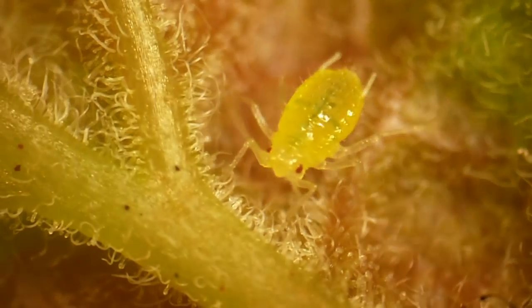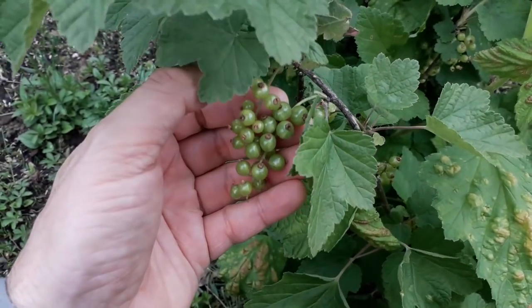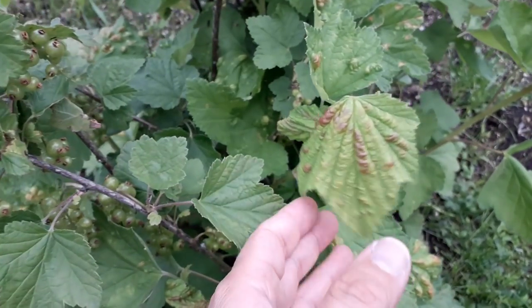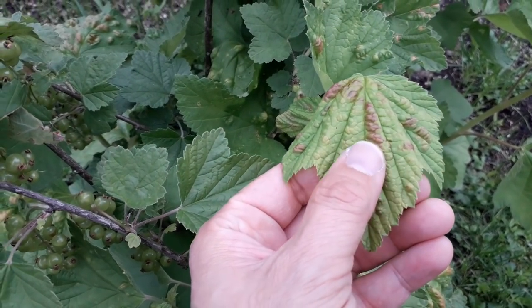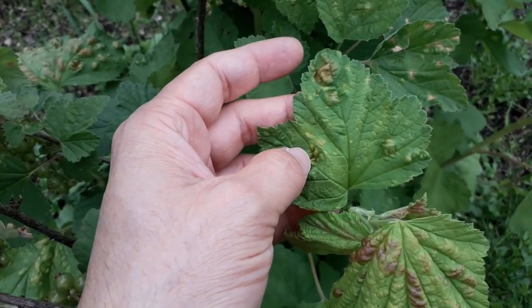This is an aphid and what the aphids did is they destroyed my red currant plants. Red currants are berries and I planted them a few years ago but they never really grew properly, and now I know why. The aphids destroyed the leaves.